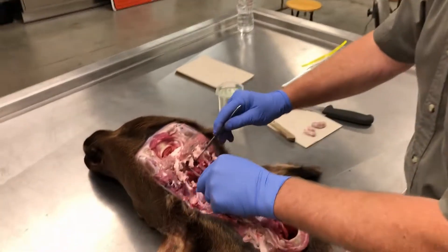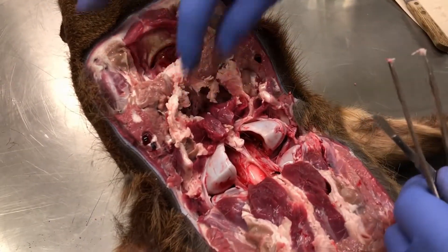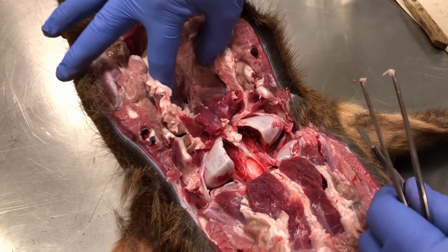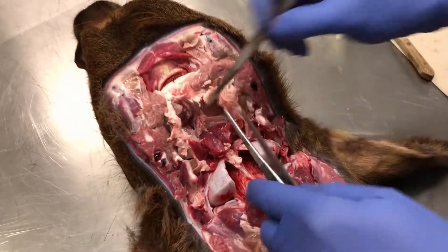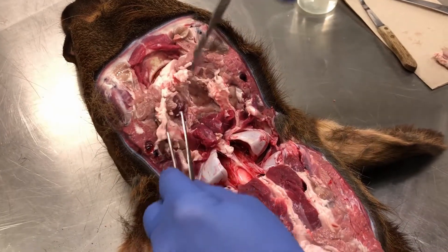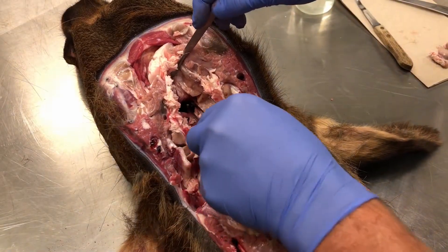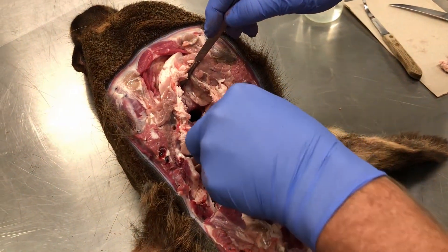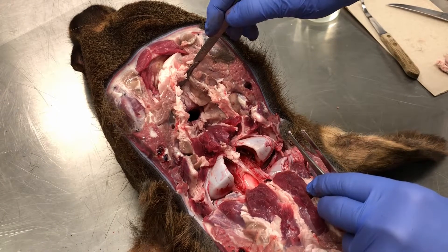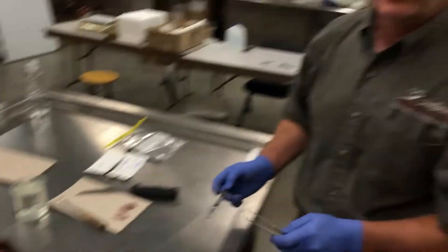So if we look at this animal once we've got them pulled, you're going to find these two muscle tissues, and if you look down in here when you get these pulled out, you should have two voids where these nodes were. If I cut down through right here, you'll notice that's the throat cavity right there — so those nodes are right down in here next to the throat cavity. That's a quick video on pulling the retro pharyngeal lymph nodes on an elk. Thank you.